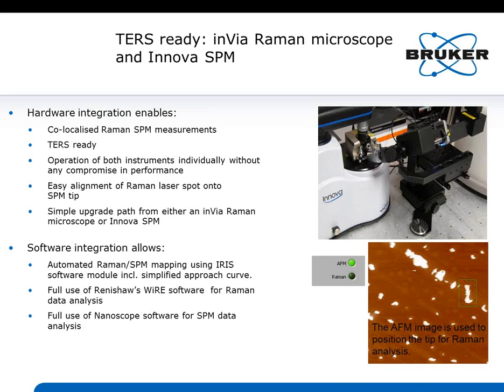So it's not just enough to take two plates and drill a hole into it and glue some piezos underneath and claim, oh, I have great optical access, but you have a not so good AFM. That doesn't really help you in this case here. You want an extremely stable AFM for these types of measurements. That's one of the reasons why we chose the Innova for that kind of setup here.